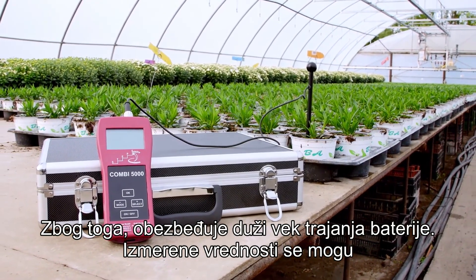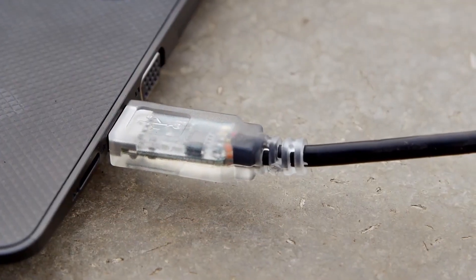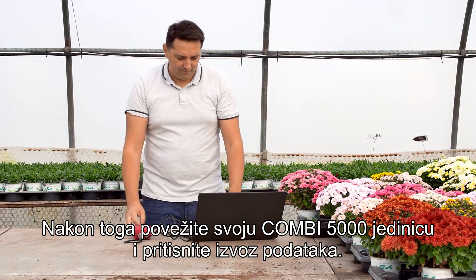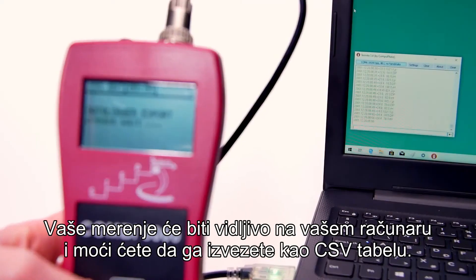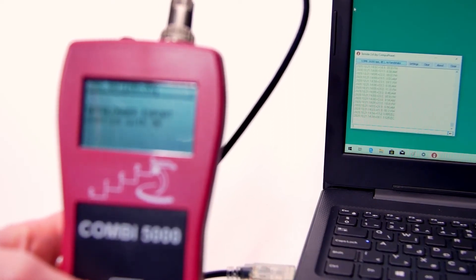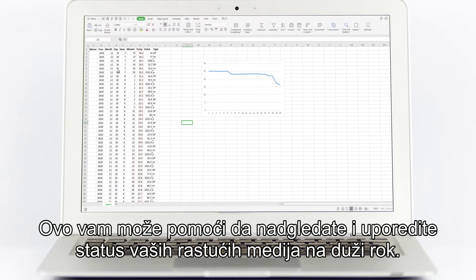The measured values can be exported using the USB cable provided with the device. Open a serial monitoring program on your computer. Afterwards, connect your COMBI 5000 unit and press export data. Your measurements will be visible on your computer and you will be able to export them as a CSV table. This can help you monitor and compare the status of your growing media in the long term.